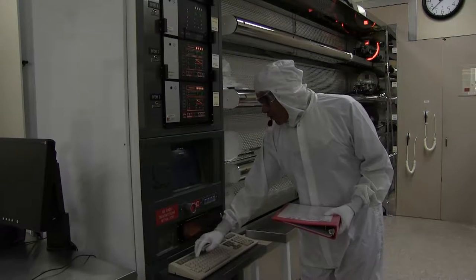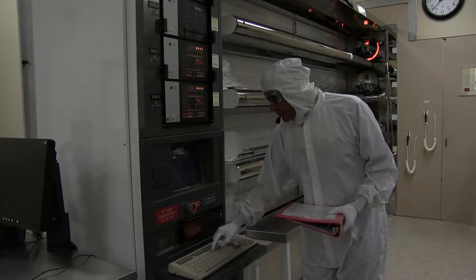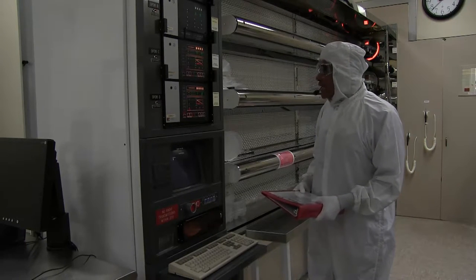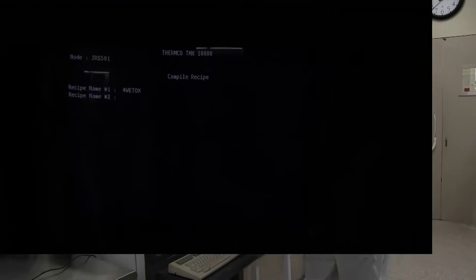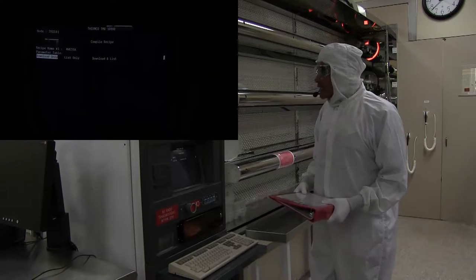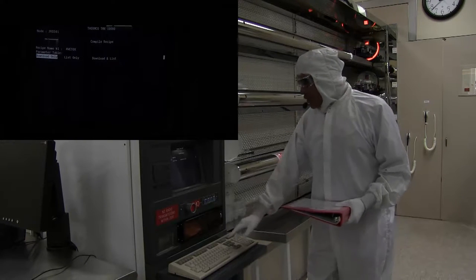Enter the recipe name. In this case, we're going to put in for wet aux. For recipe name number 2, you're going to press Return. Parameter table, press Return. Download only, we're going to press Return.